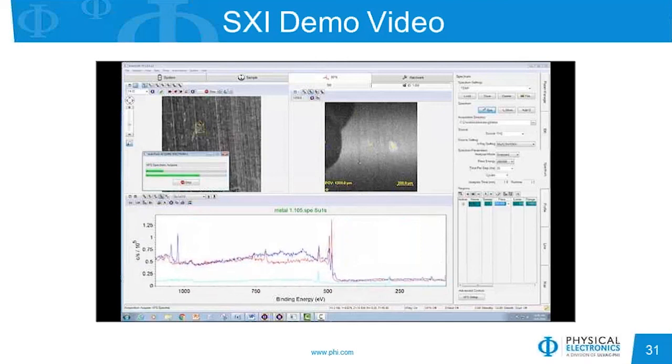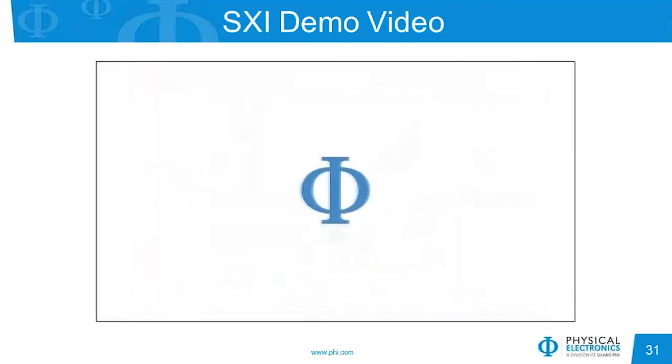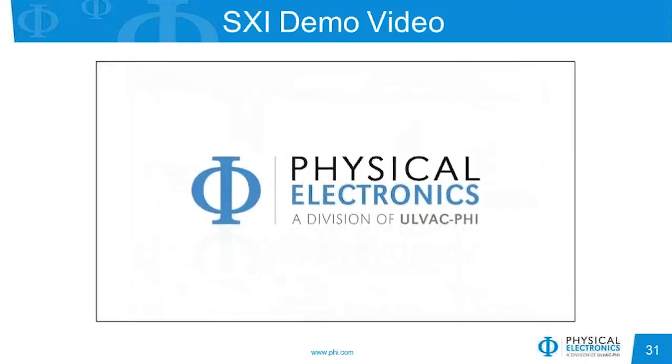So we can see that in the middle region we are detecting zinc. From the white spot, the red spectrum, we are detecting tin, which could be underneath the zinc. And in the dark spot on the SXI, again in that teal spectrum, we are seeing peaks for nitrogen, oxygen, and carbon, which could indicate that we just have an organic contaminant.